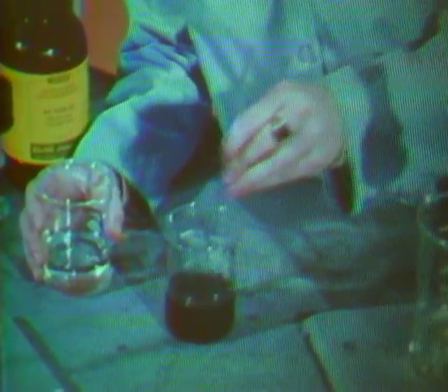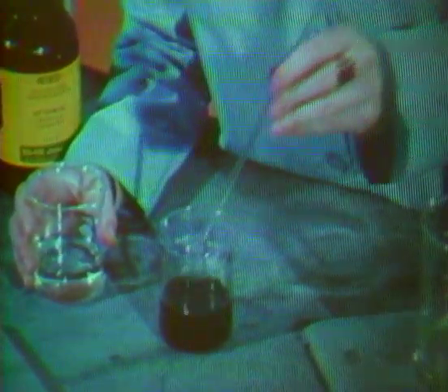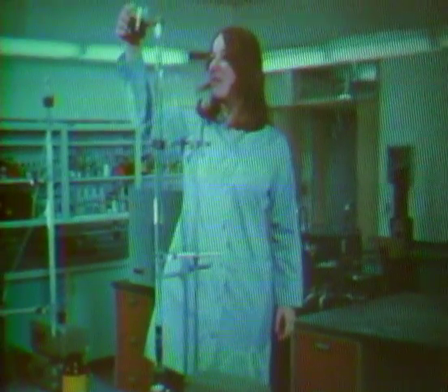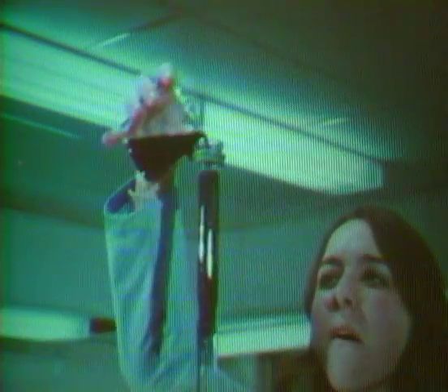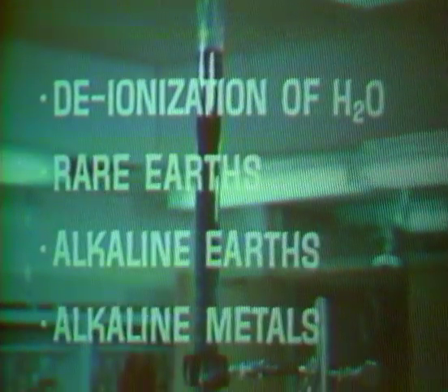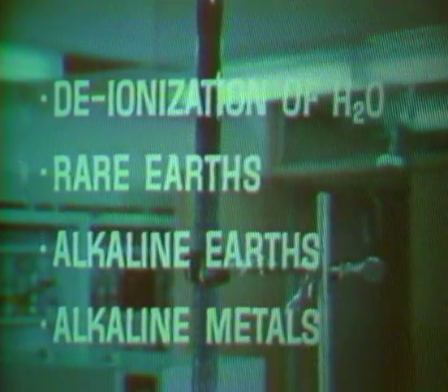group. The resin is pre-soaked in water to allow swelling and to remove any fine particles. It is then packed wet. When a solution of the sample has been added, water will be pushed continuously through the column. Ion exchange finds major applications in deionization of water and separations of rare earths, alkaline earths, and alkaline metals.